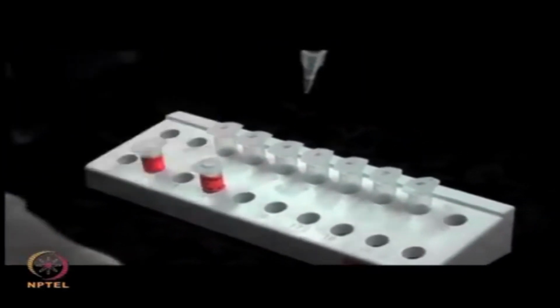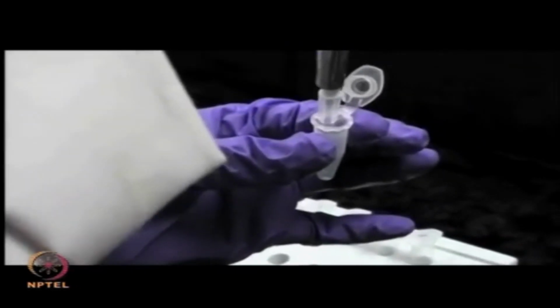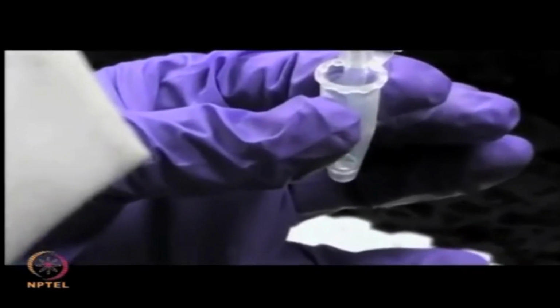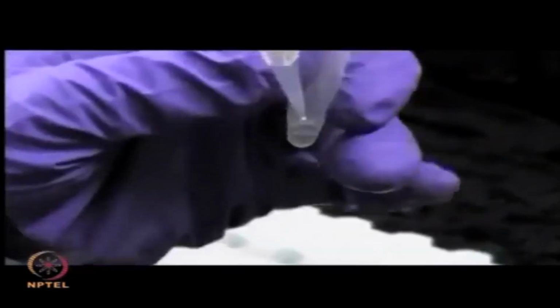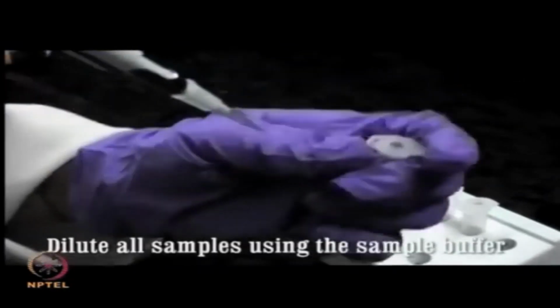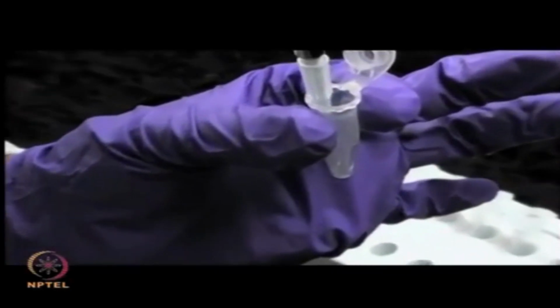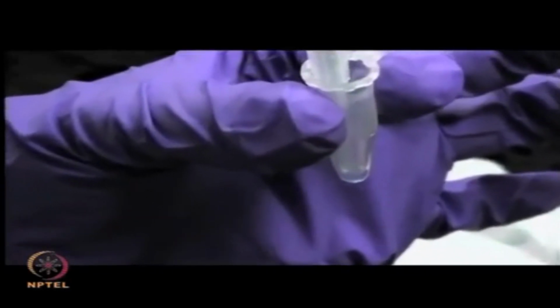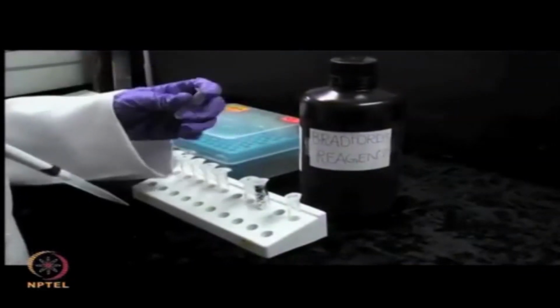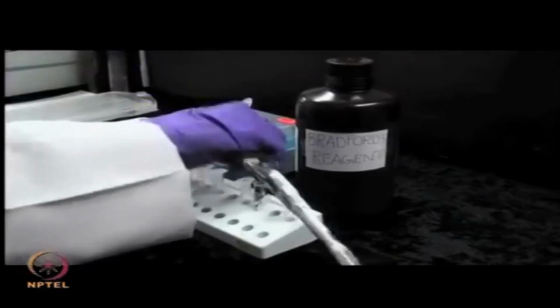Bovine serum albumin is often used as a standard. Then add the unknown protein sample whose concentration is to be determined to the appropriately labeled tube. Dilute all the samples uniformly using the sample buffer. Then add the Bradford color reagent to each tube and mix well.